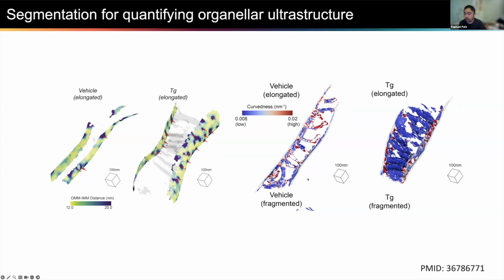I think this is very important because when you look inside a cellular environment, it's really a jungle. There are so many features that look so different from one another. This type of analysis allows you to decode the interesting biology that's hidden inside this complicated tomogram.